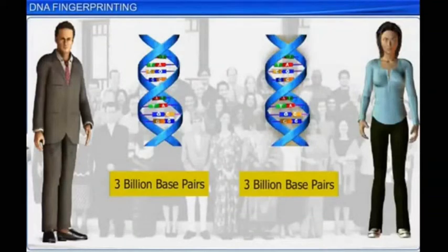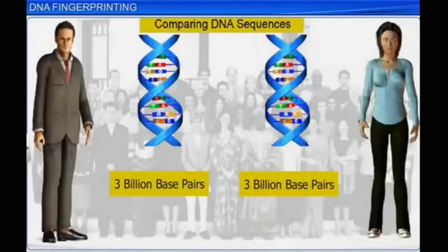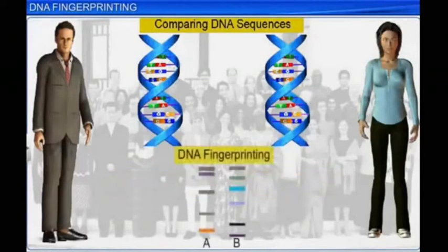An easier and quicker way to compare is DNA fingerprinting, which is the test to classify and analyze DNA or genetic information.